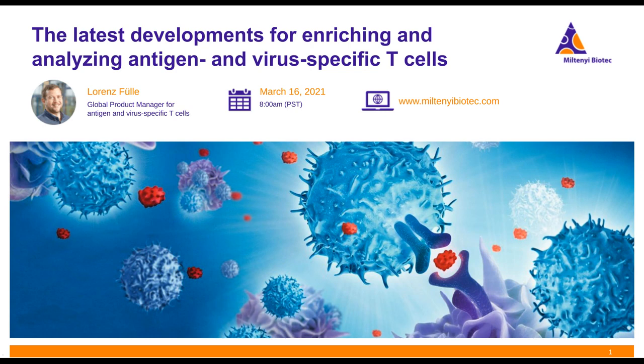Okay, great, thank you. Now, are there similar kits available for mouse tissues? For example, enrichment kits for activated T cells? Yeah, so this is something we are currently working on. However, what we already have is an enrichment kit for CD154 positive T cells, which is the CD40 ligand, mostly to enrich antigen-activated CD4 positive T cells.